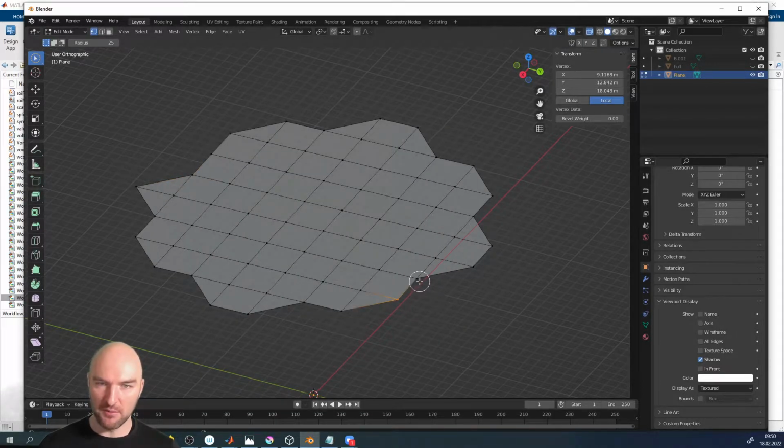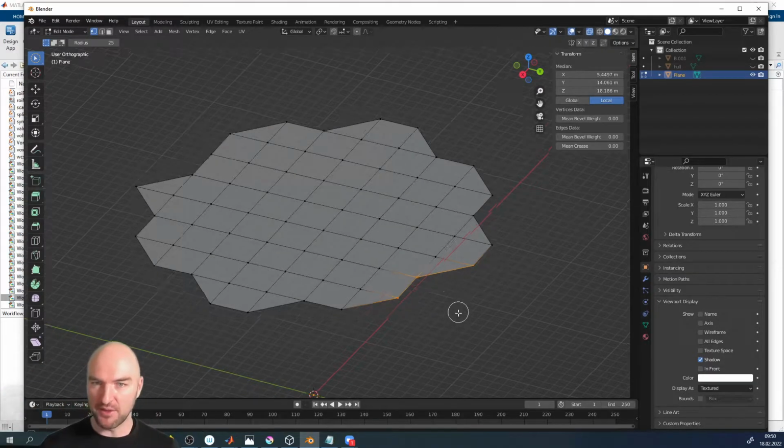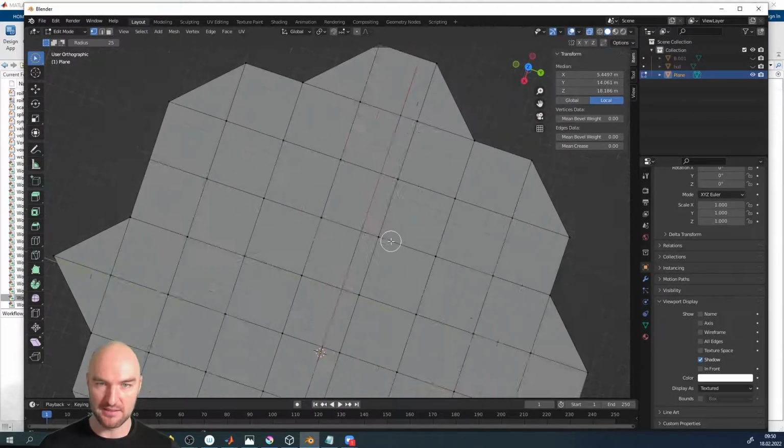If I want a face between these three, I click on them, hold Shift pressed, and then press F, and it creates a face. You can do that with 2, 3, 4 or more vertices. Blender actually supports polygons. I highly discourage you from creating polygons because then the plane is really badly defined. That's something for people that want to make movies, not for people that want to do data analysis.